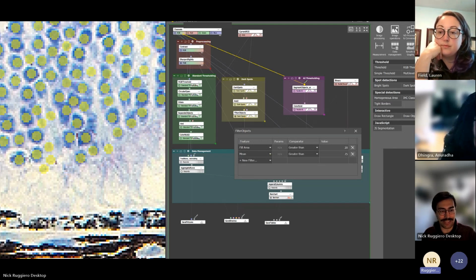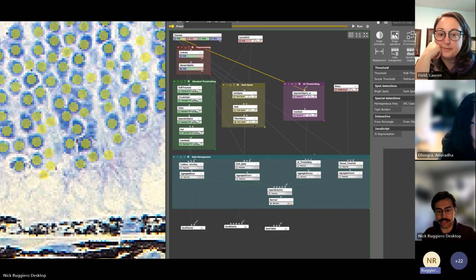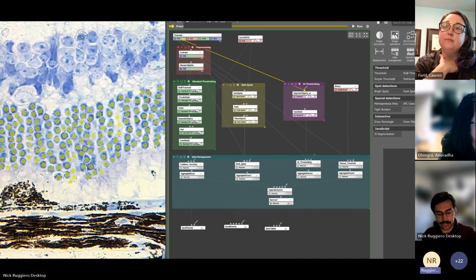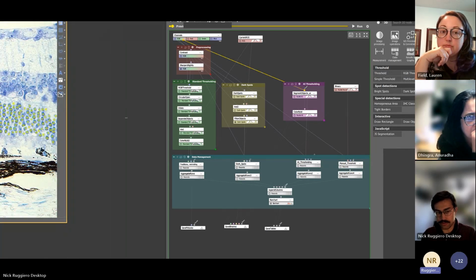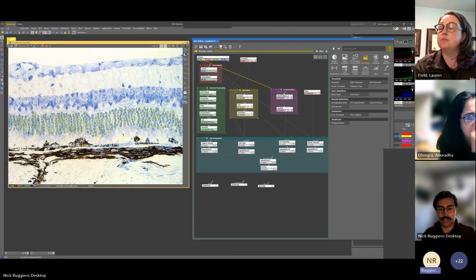We're still grabbing this, maybe we might be interested in, I'm not sure. But I don't think that we're interested in some of these really, really light regions. So this one I thought did pretty good, but I wanted to plot it out and see if the data actually looked that way. What I found is that this one tends to overestimate the number of nuclei that are in these cells. So it ended up not being the best solution.